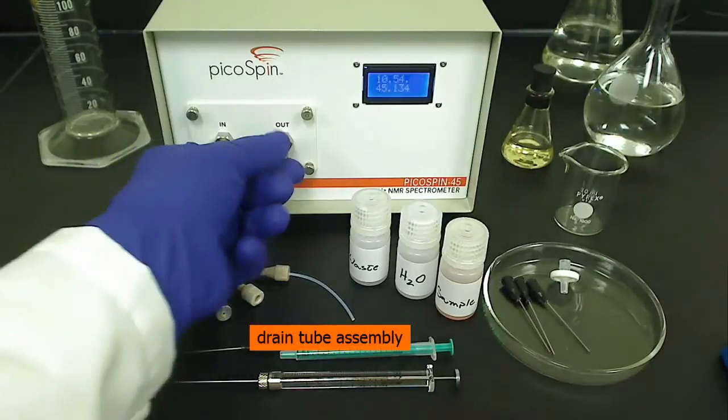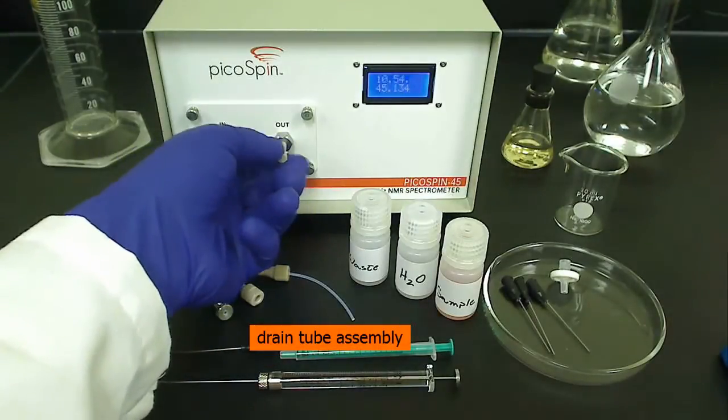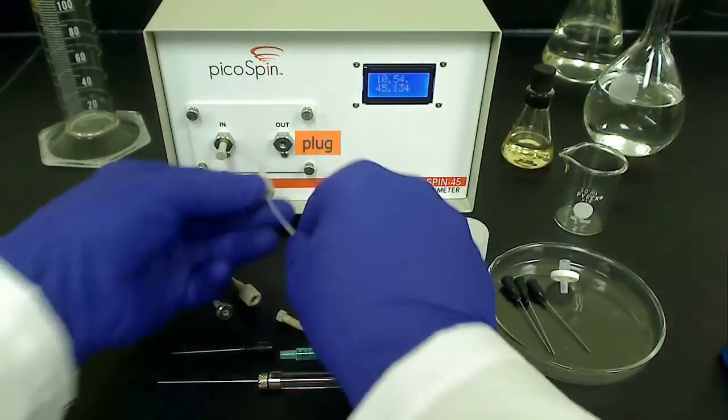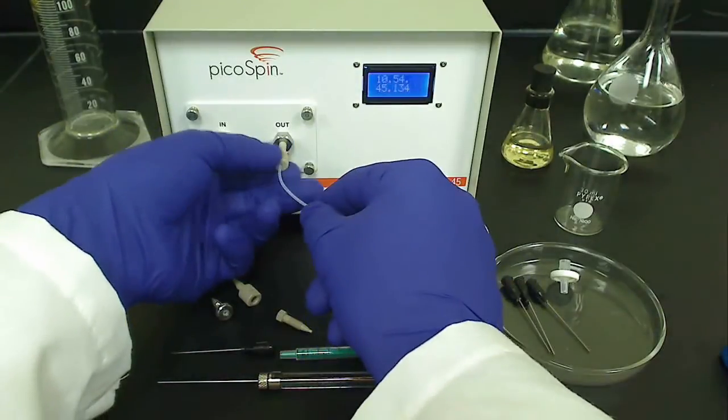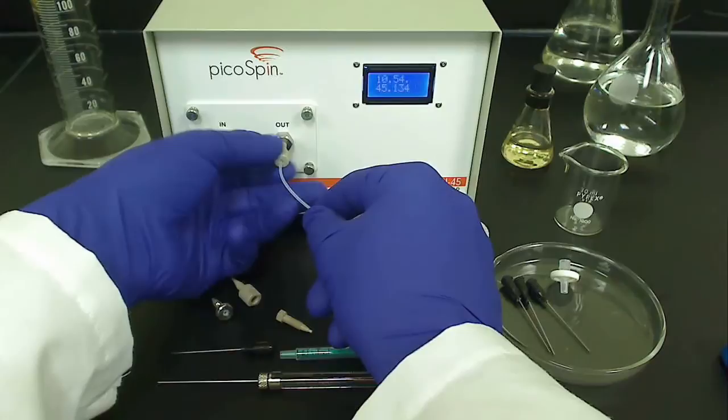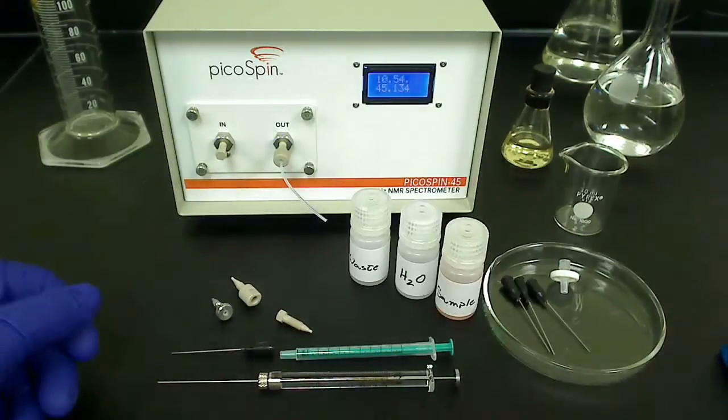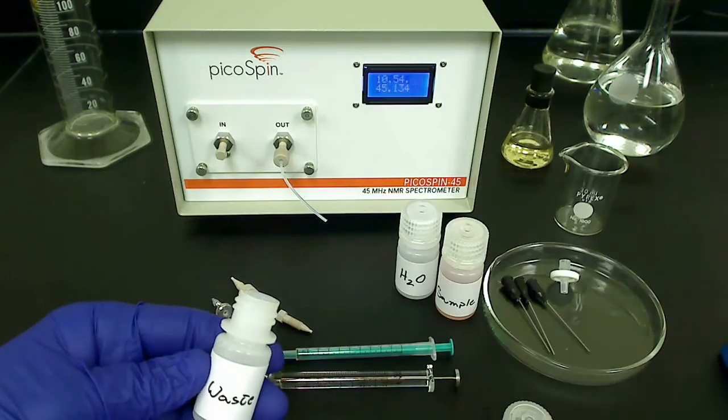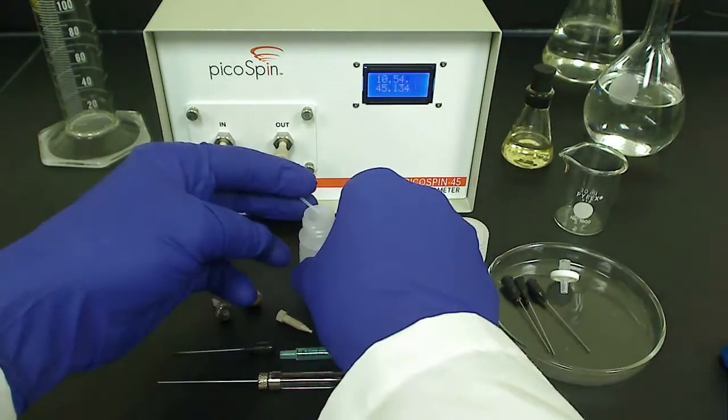The first thing we need to do is attach the drain tube assembly. We'll remove the plug in the outlet fitting and screw in the drain tube until finger-tight. I like to orient the drain tube sideways so the tubing can sit on the rim of the waste collection bottle. This will allow us to observe liquid droplet formation at the exit as we inject our sample.